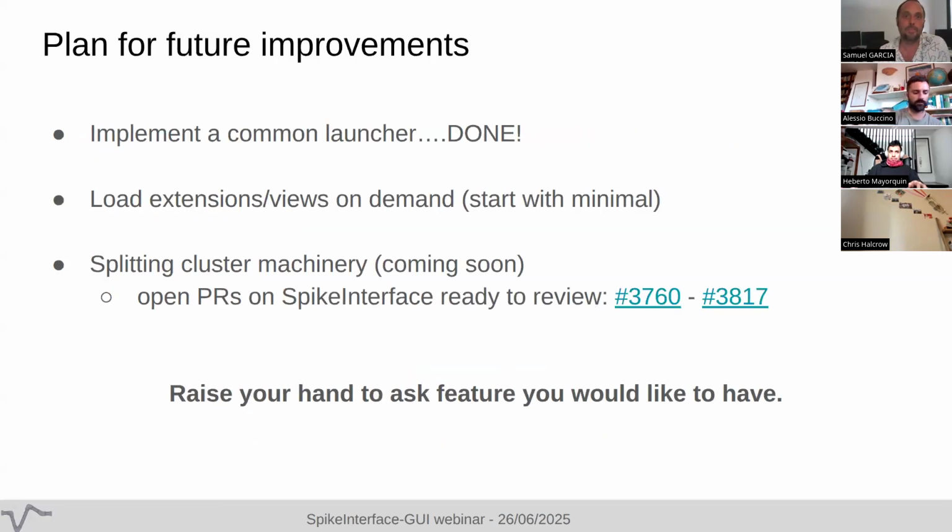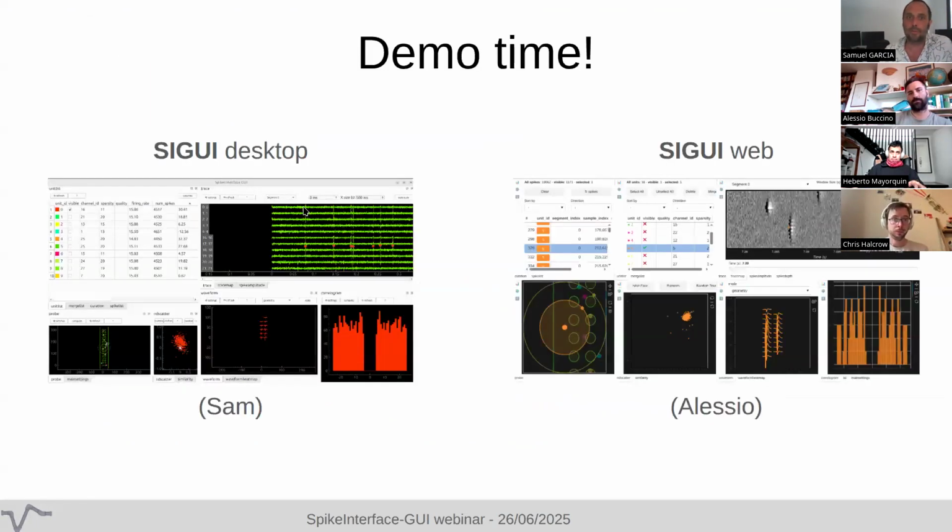You will see this. So we have some plans for improvements. The main one you can remember, that we are working on, is to make manual splitting, and we are on it. If you have some demands, maybe you can ask some questions in the Q&A about new features, but you don't know the features yet, so maybe wait for the presentation.